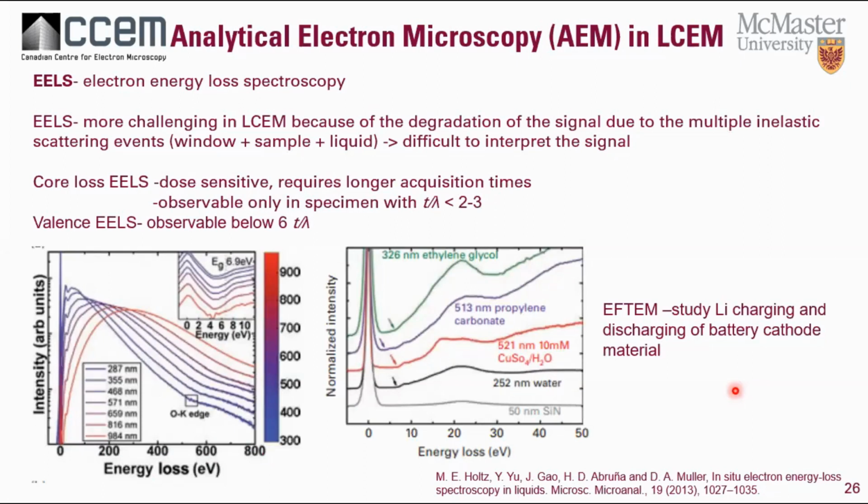I'm going to talk now about two of the analytical electron microscopy techniques. So I'm assuming that you are a bit familiar with EELS and EDX. I actually had 2 slides about that, then I had to cut.